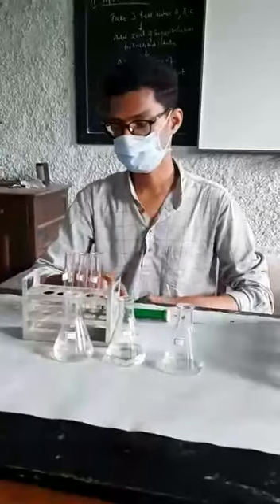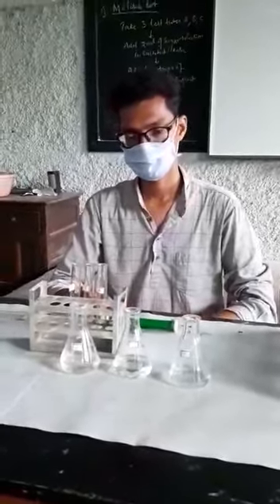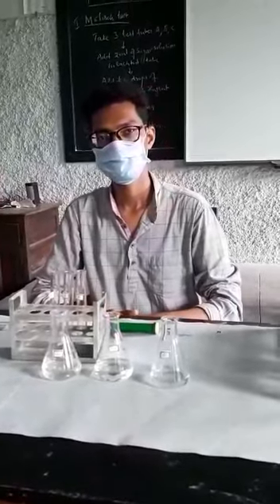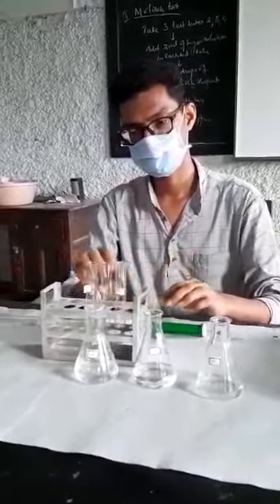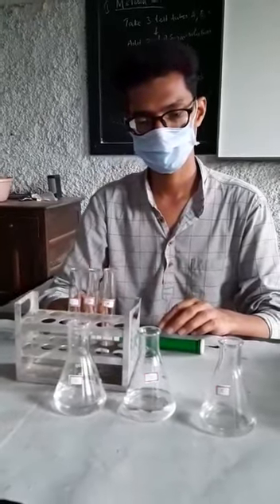Fine. Now, shall we start with the experiment? Yeah. Now, I request Mr. Varun to demonstrate the Molisch test for identification of carbohydrates. Now, he will take 3 test tubes and label them as A, B, C. Okay, he has labeled them as A, B and C.